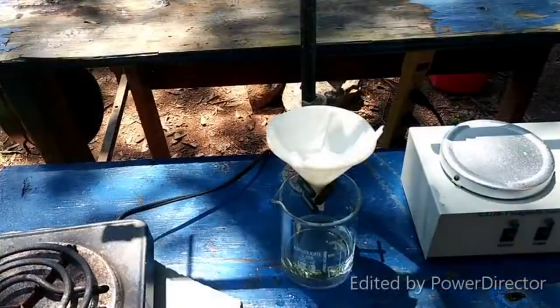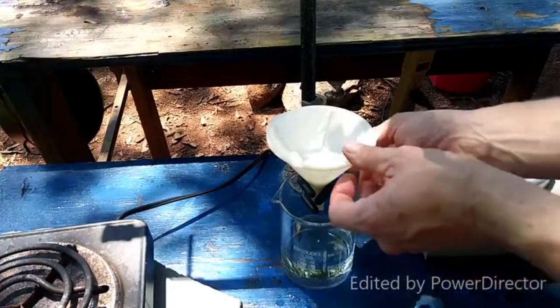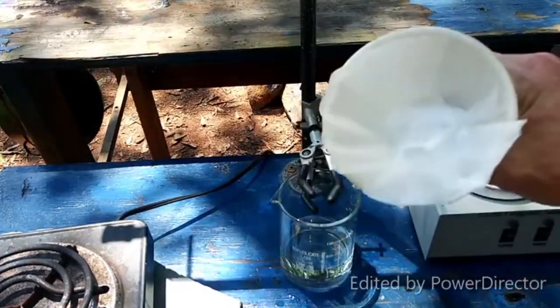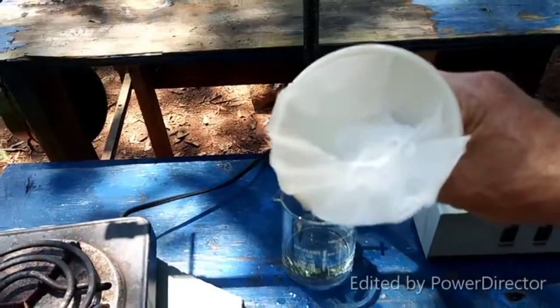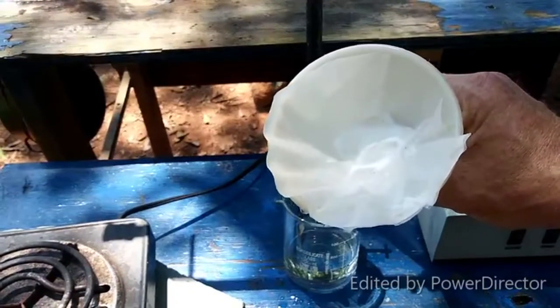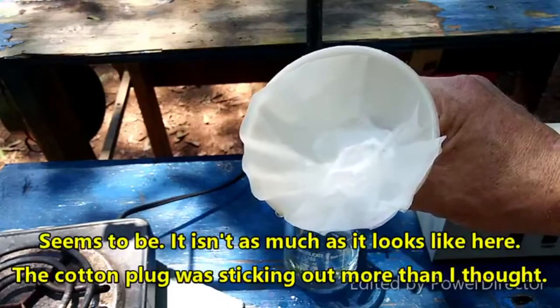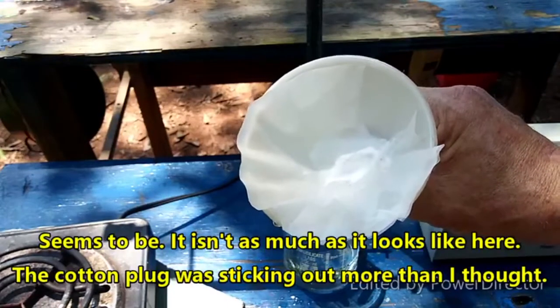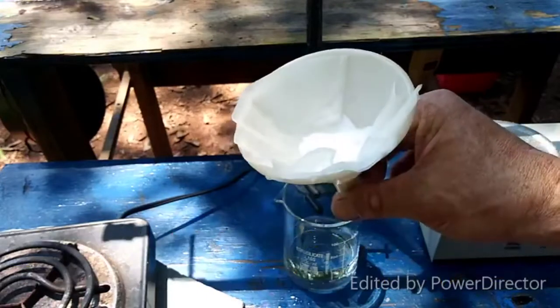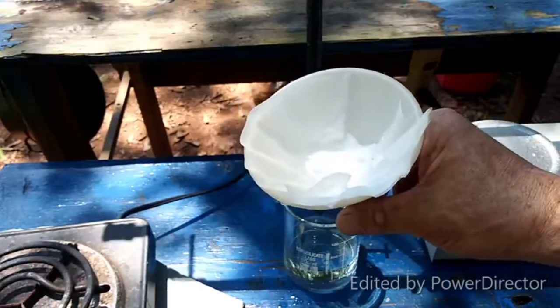I have filtered off all of the lead and barium carbonate precipitate. There was a fair bit of it, but this may be normal for all I know. The fact that we ended up with so much lead monoxide tells me that the reaction probably did work, so I'm just going to proceed as if this is normal.